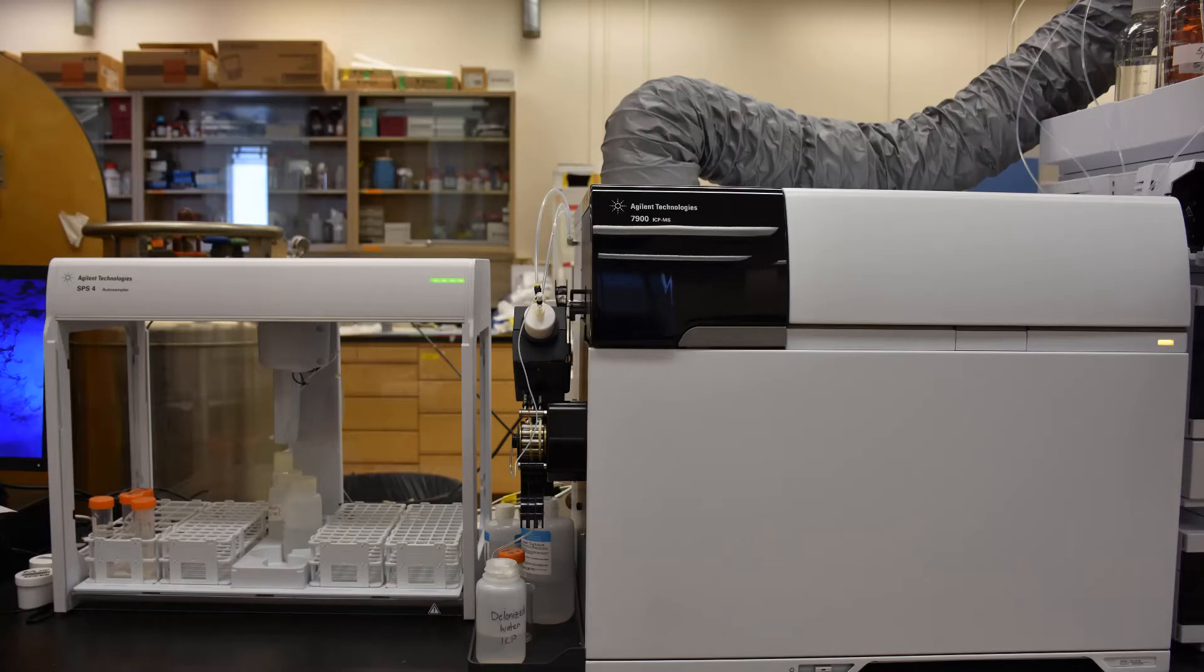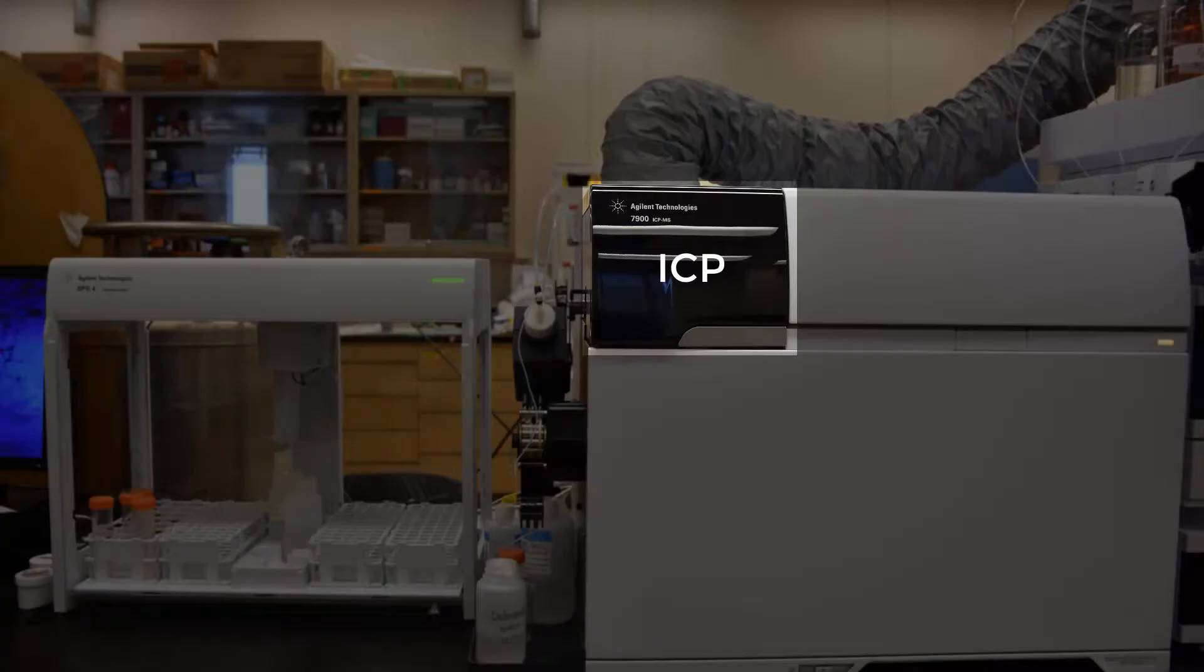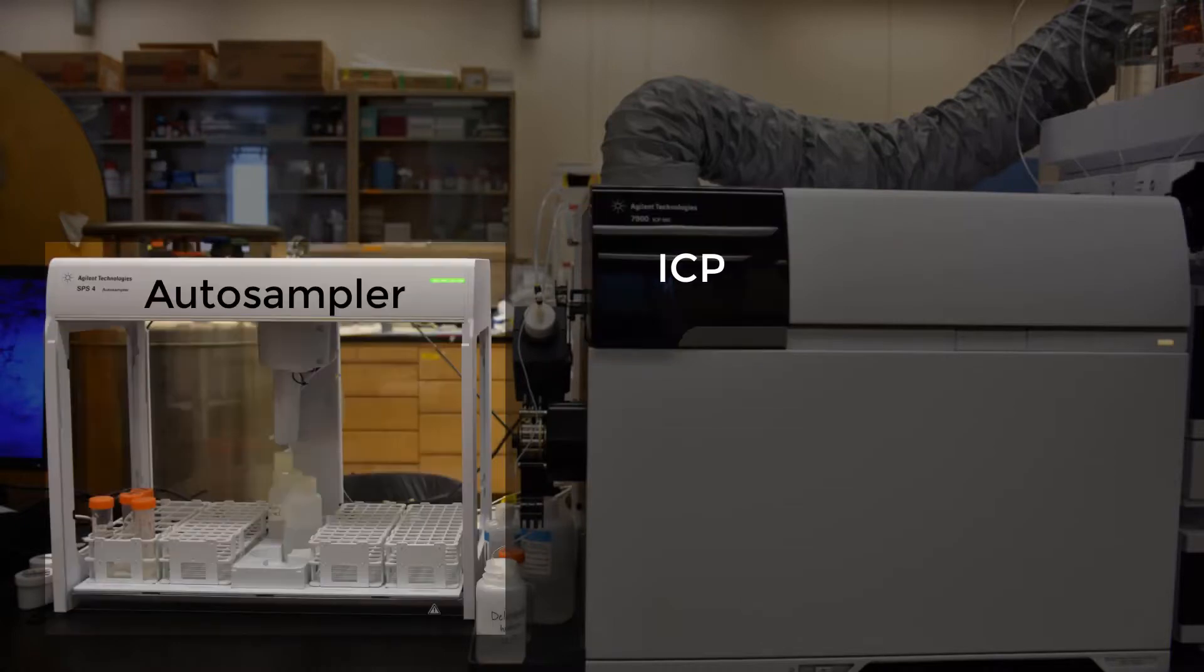ICPs are useful for detecting trace concentrations of metals in aqueous samples. This is an ICP shown with an autosampler and detector.